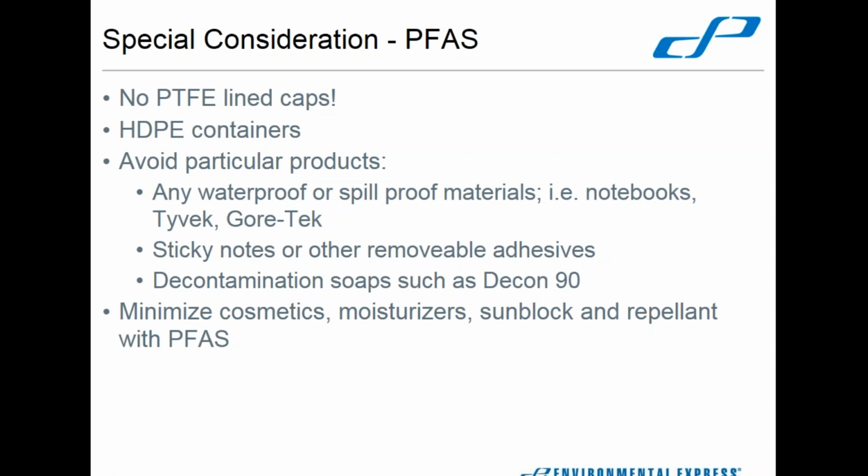Sticky notes and other removable adhesives can either contain fluorinated compounds in them, or because of the adhesive nature, retain fluorinated compounds and potentially contaminate your sample collection. Decon 90 is a popular decontamination soap, and it actually has some fluorinated cleansing compounds in it. So you can't use any of that around your sampling area.